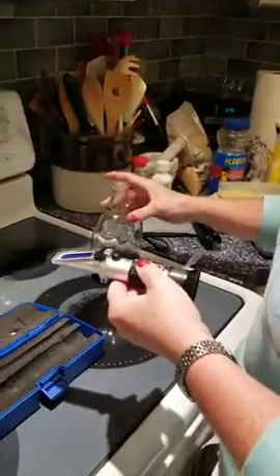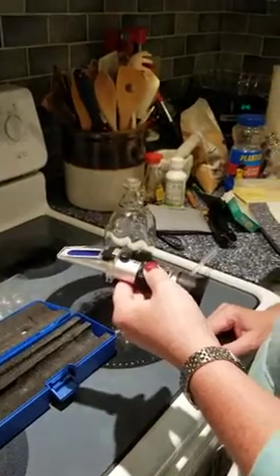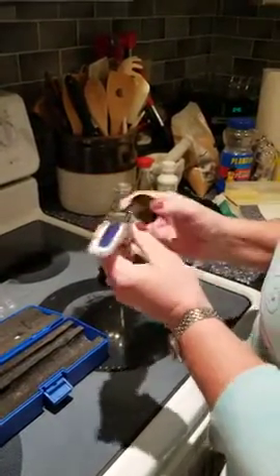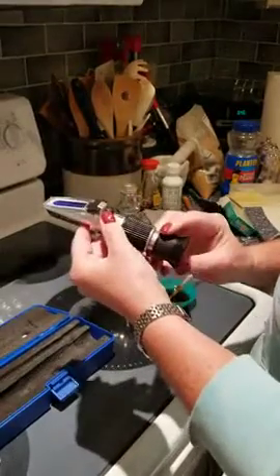My syrup is reading right at 66 and a half brix, which is perfect. I know that my syrup's right from when I made it using my hydrometer. So this is not a bad little product for $22.